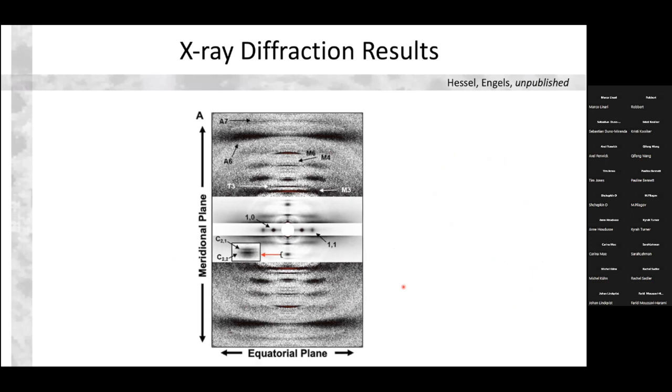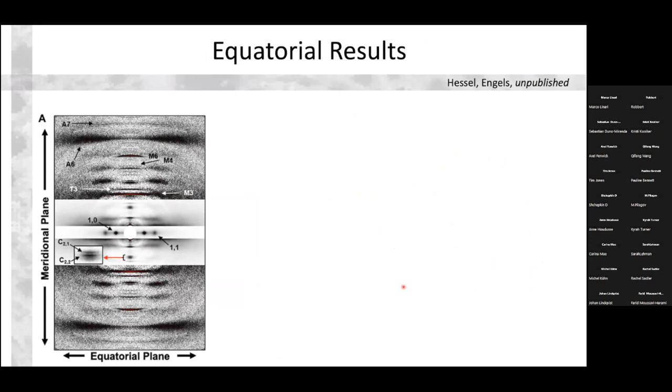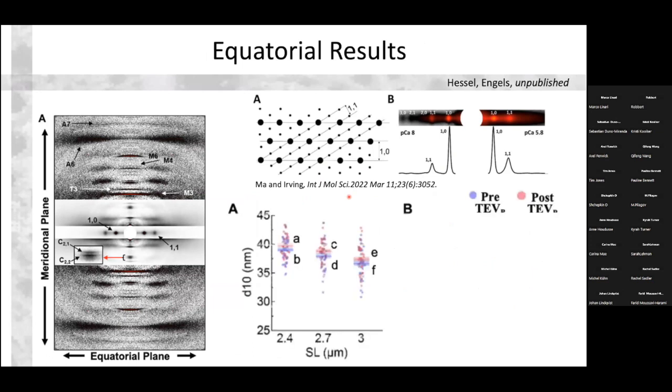Okay, so what else did we find at a first glance of the data? And I say first glance because both Nick and Anthony have been furiously trying to reduce the data and get these results out for you. So you are, like I said, some of the first people that have seen this. So this is just talking about the equatorial results now, and a beautiful review article by Wei Kong and Tom with some really nice figures showing what these patterns are giving us information on.